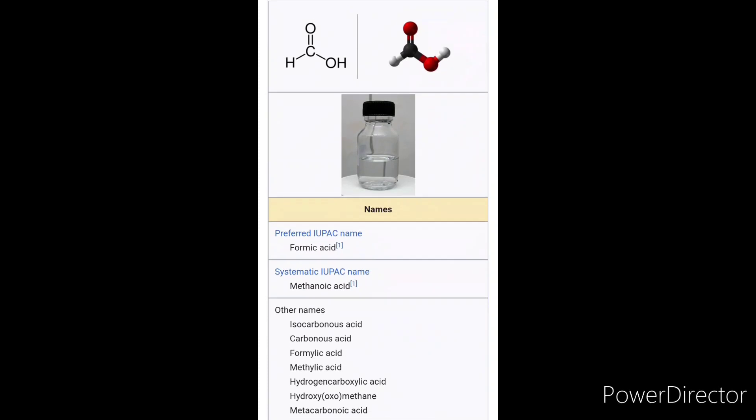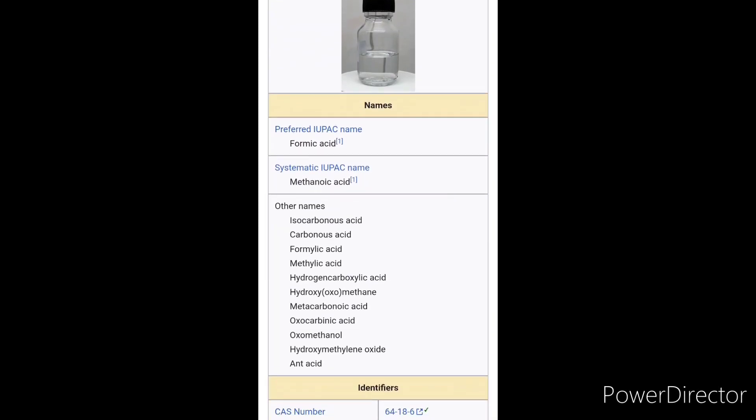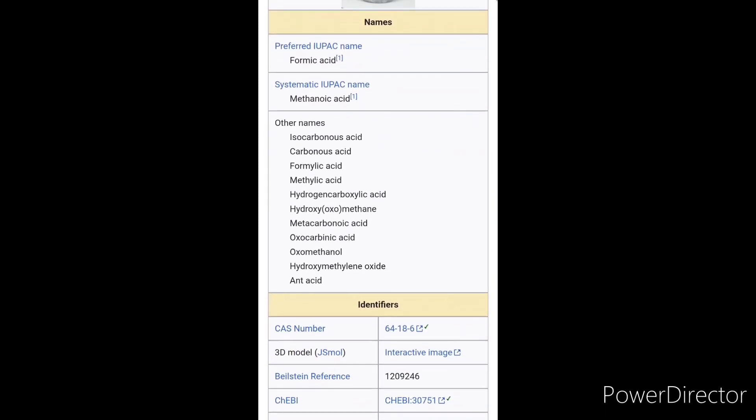Hello, and welcome back to the lab. Today's project is making formic acid with easy-to-get chemicals.